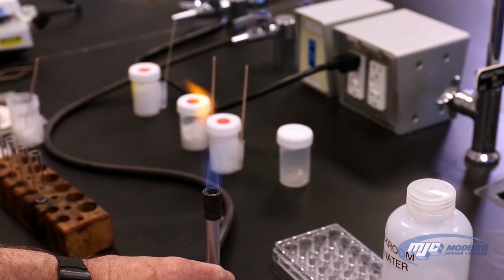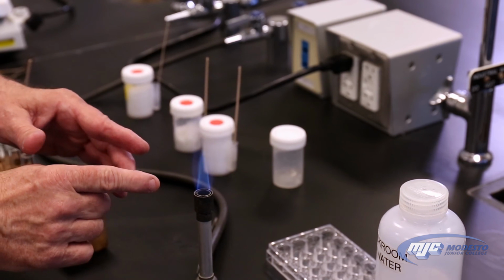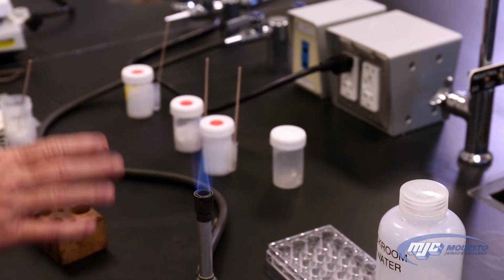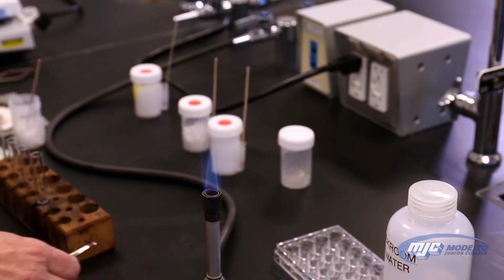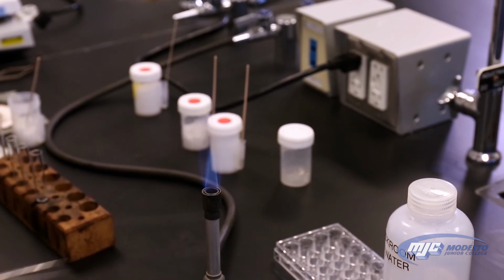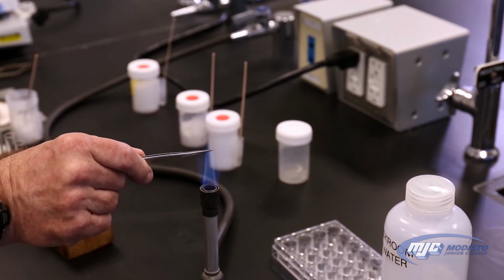I'm going to give it a little more oxygen because, I don't know if you can see it, but there's this bright blue inner cone. That's what we're looking for. That's the kind of flame that we want to get on a Bunsen burner. And by the way, the hottest part of this flame, which is usually where we want to put stuff on a Bunsen burner, is the very tip of that inner cone right there. Not up here, right there.